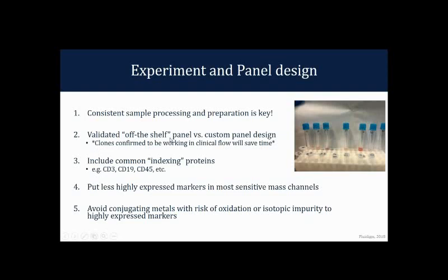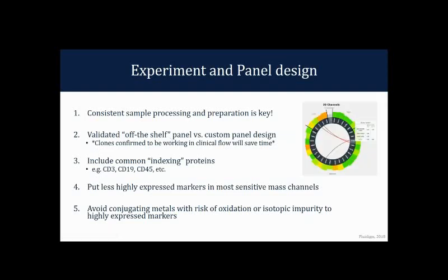Next, the decision to either use a validated off-the-shelf panel, of which we have a few here at UBC, versus a custom panel is the next decision that needs to be made. Like I said, we do have base panels that we use, and we build upon these, inserting and removing different markers depending on the question being asked. So we're certainly able to modify these more easily than building from the ground up, but there is still a possibility if you have a really unique system that you're looking at.